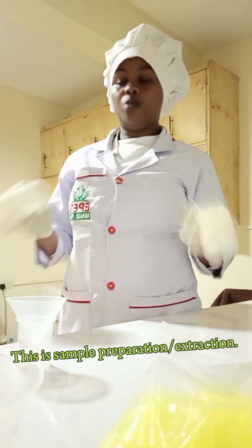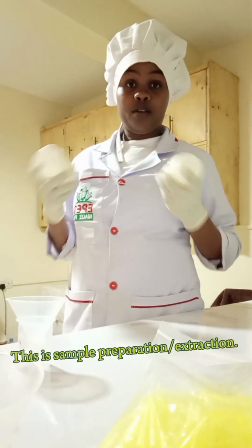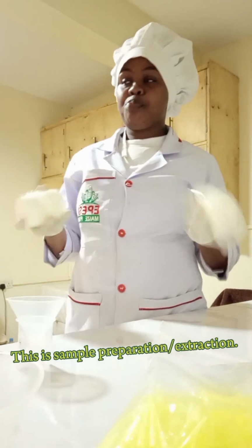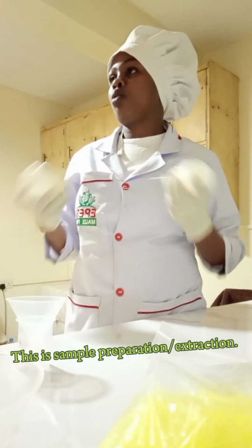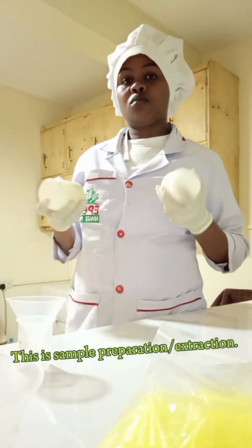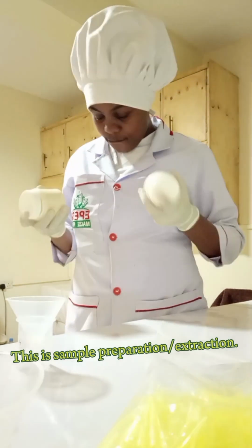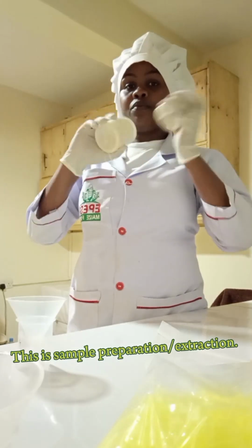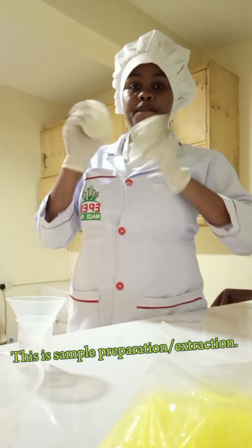In today's video I'm doing an aflatoxin test. Many of you may wonder what's being done in the lab. For example, when you're supplying maize to a certain company, you don't know what happens when someone tells you that they're going to do the aflatoxin test. So let me take you through this procedure so that you can understand what happens.